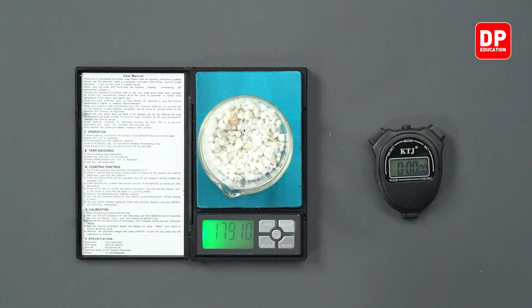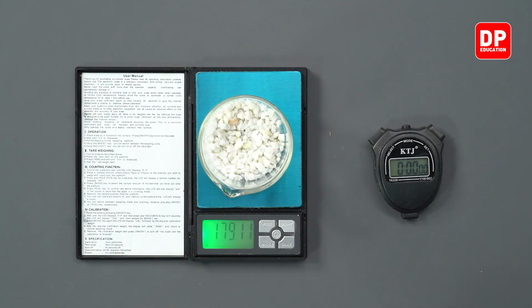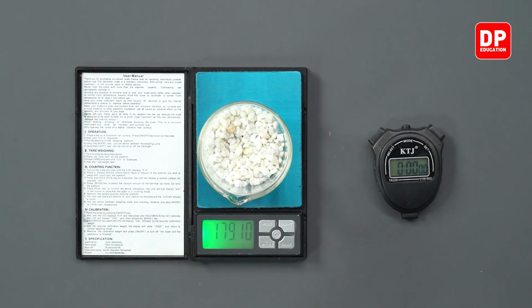The mass of the beaker was 79.06. So the amount of calcium carbonate in here is 100.04 grams.